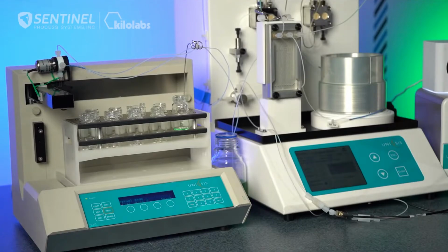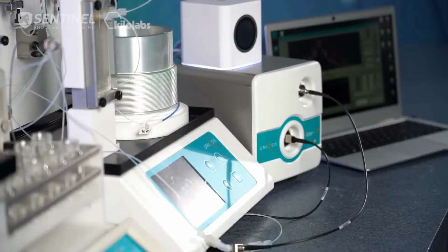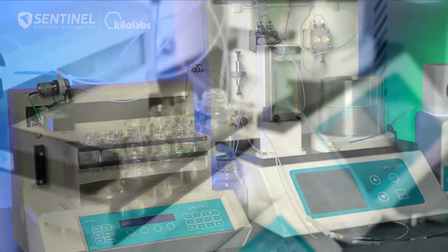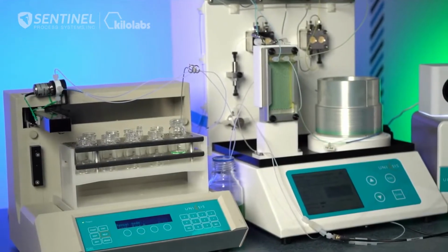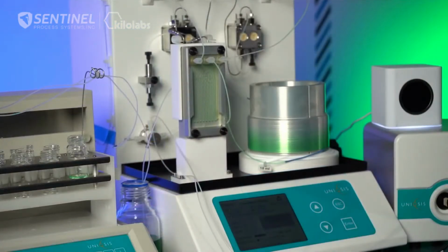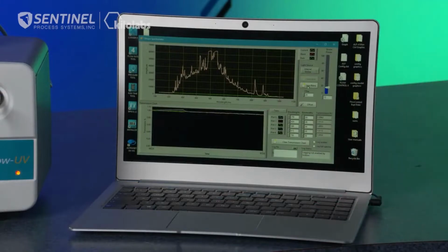Here the solvent is going, the reagents are going through the mixing chip. And as you can see, the green color is now in the mixing chip and is now starting to enter the coil. And as it exits the coil and goes through the flow cell, we'll be able to see the signature on the bottom screen here. Okay, as you can see, the green color is coming to the top of the coil, hasn't started to exit it yet. And on the screen here, we see no change in transmittance.